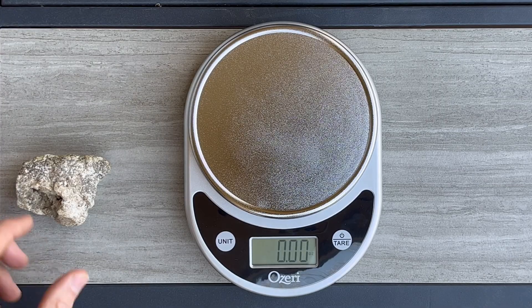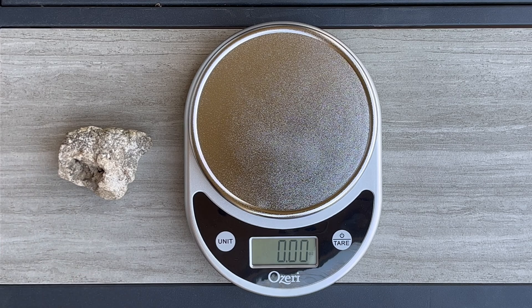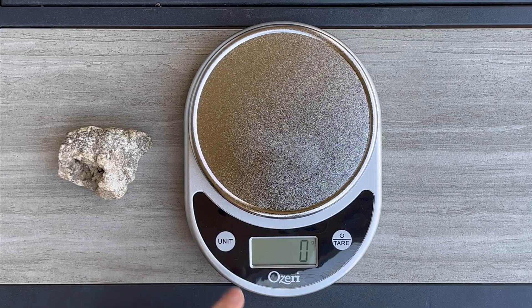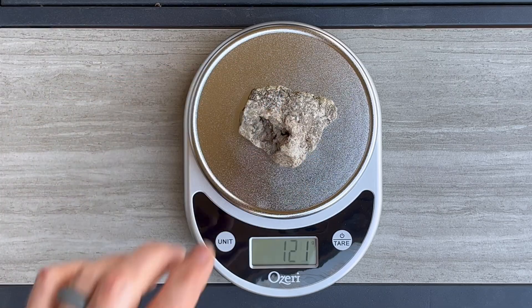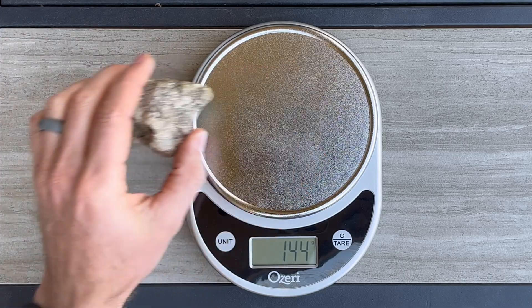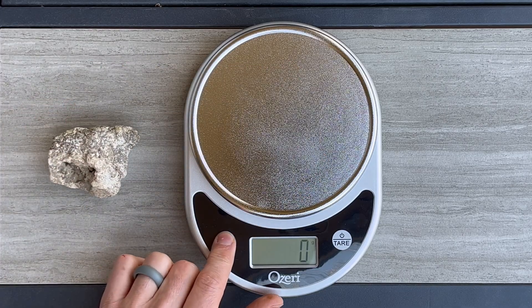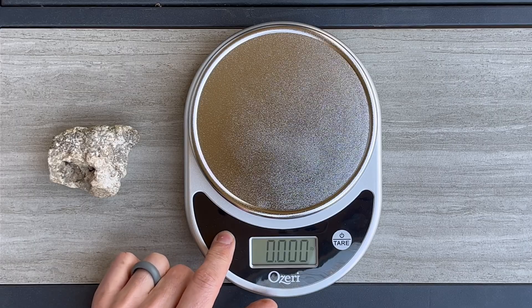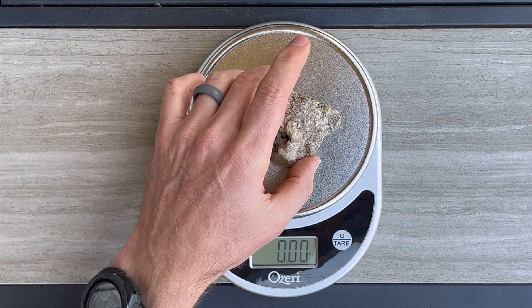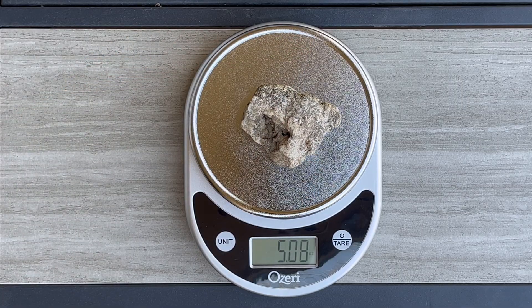Let's give it a try. Suppose I wanted to find the mass of this rock — I'll need to select either grams or kilograms. I'm using grams, and the mass of this rock is 144 grams. Now suppose I wanted to find the weight of this rock. I'd select pounds, pounds and ounces, or just ounces. I'm going with just ounces — the weight of this rock is 5.08 ounces.